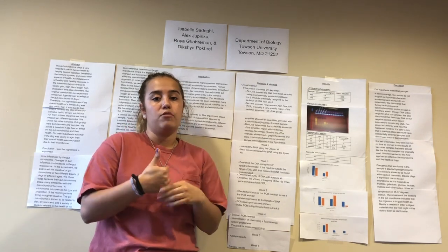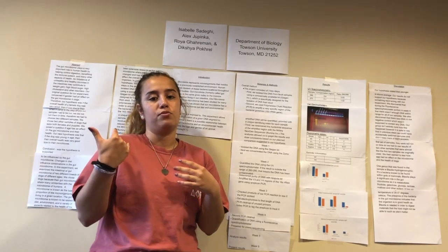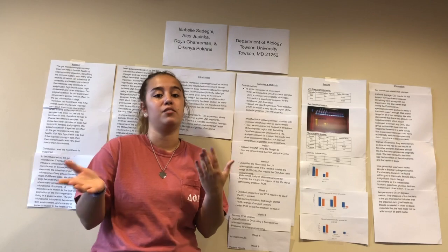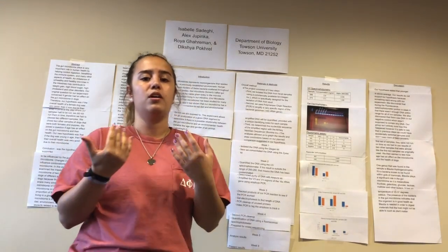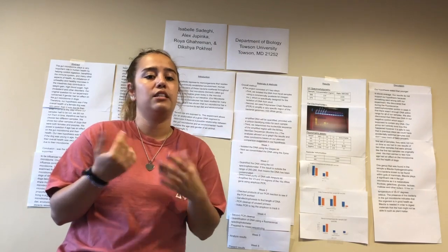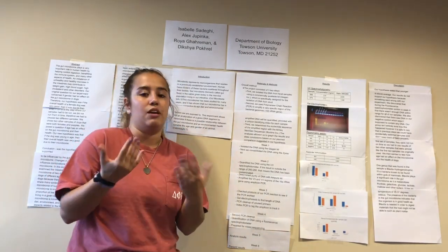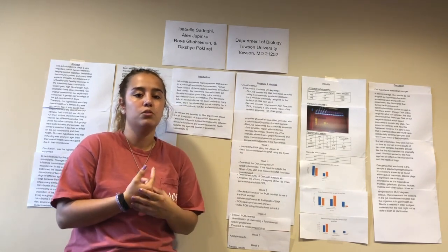So discussing our quantification results for the index PCR cleanup, the quantification results from the index PCR had very low concentrations of DNA from all of our samples, and DNA was found in our negative control, and our positive control had our E. coli DNA. We expected to have 0 DNA in our negative control, and it turned out that we did have DNA, which indicated that we somehow cross-contaminated our samples.